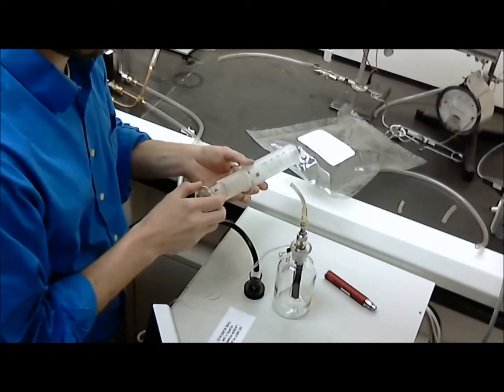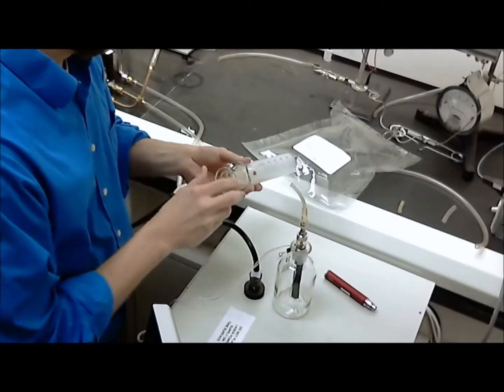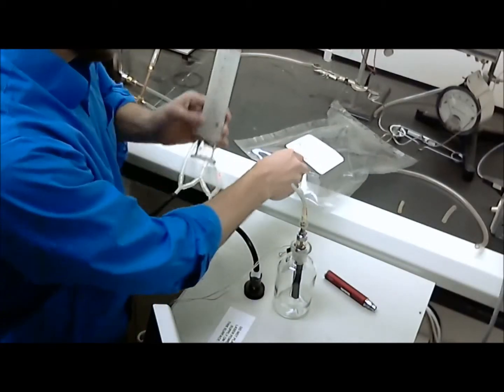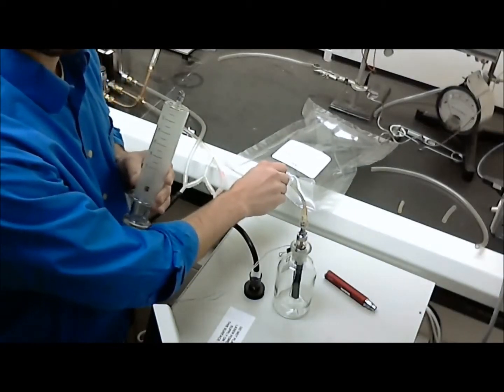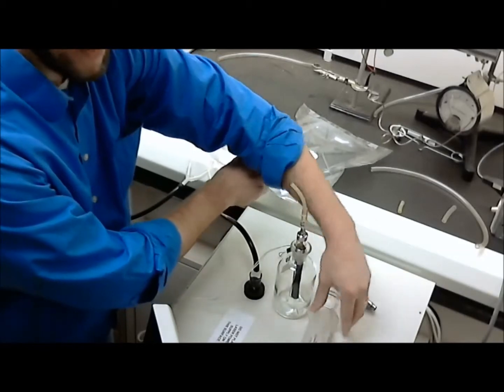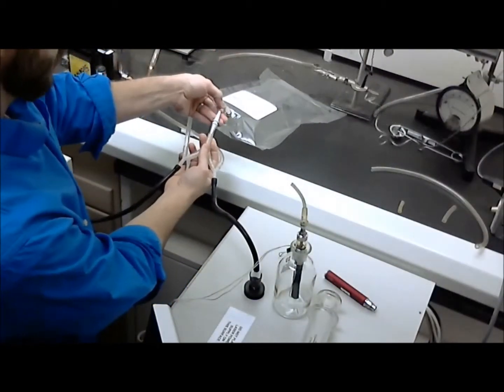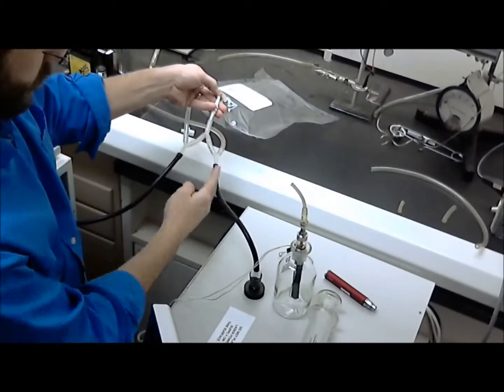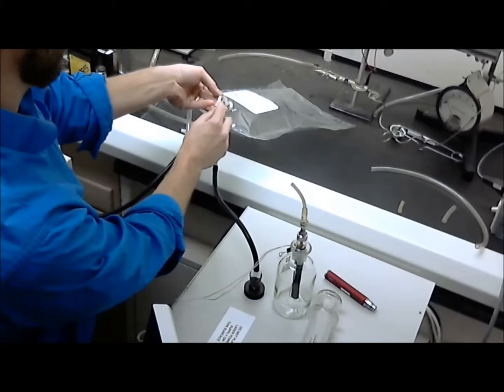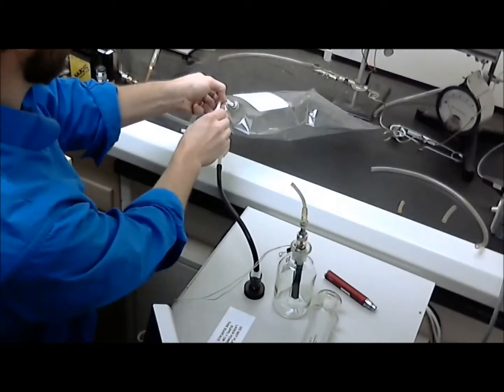The syringe was pumped 3 times to foster mixing within the bag. The bag was allowed to stand for 60 seconds and then was connected to the sampling port that was split flow to the APS and the SMPS, like so.